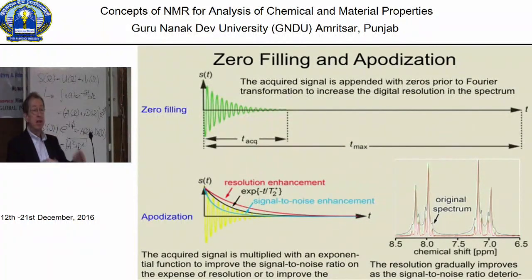And then suddenly, lines that appear not to be split show a better splitting. It's a very nice trick. It's a routine operation on spectrometers. I don't know if you have a chance to show it. It's one of the things one can do.